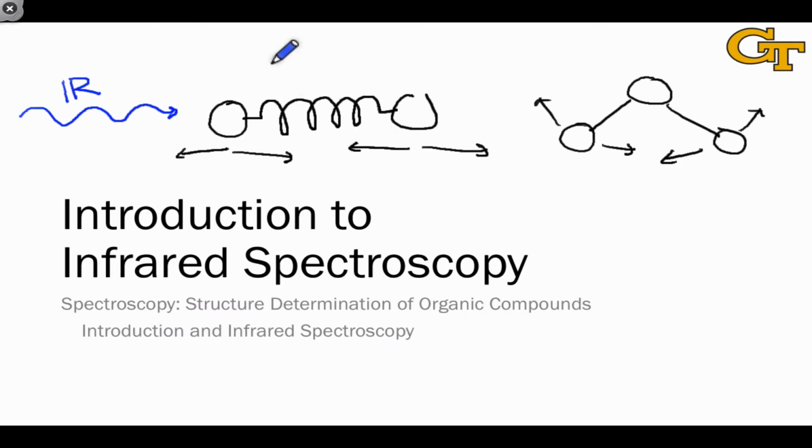These types of motions are easily excited by infrared or IR light, and for this reason, organic molecules absorb infrared light strongly. The frequency response of an organic molecule to applied infrared light is its infrared spectrum.